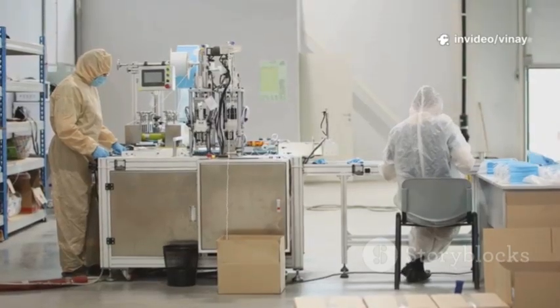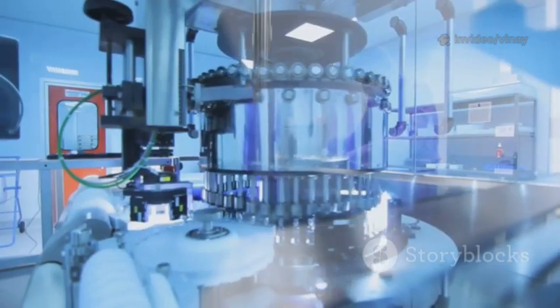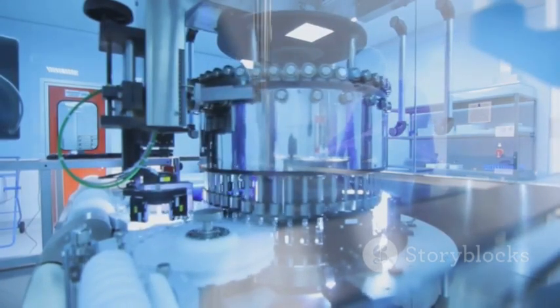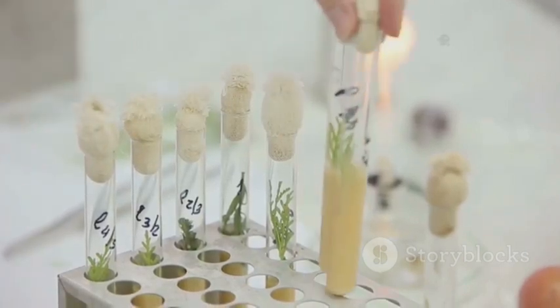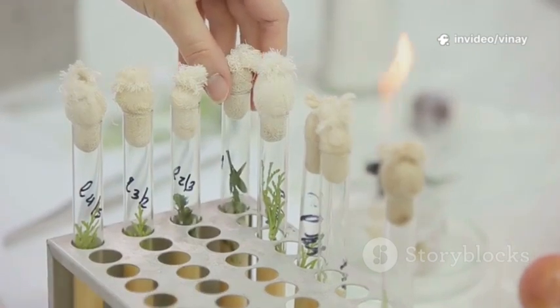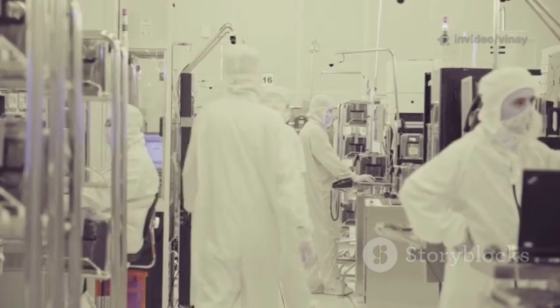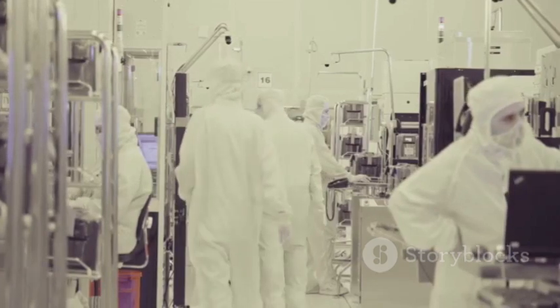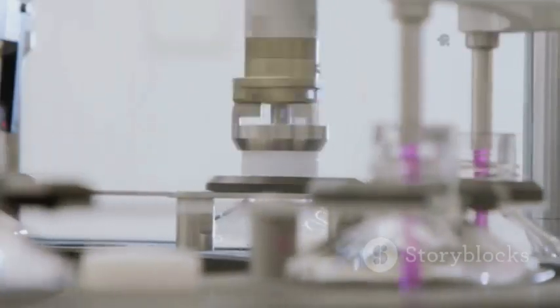A cornerstone of operator qualification is the process simulation, commonly known as a media fill or aseptic process simulation, APS. In a media fill, the actual drug product is replaced with a sterile microbiological growth medium, like soybean casein digest medium. The operators then run the entire aseptic process from start to finish, including all assembly, filling, and manual interventions that would occur during a normal production run.